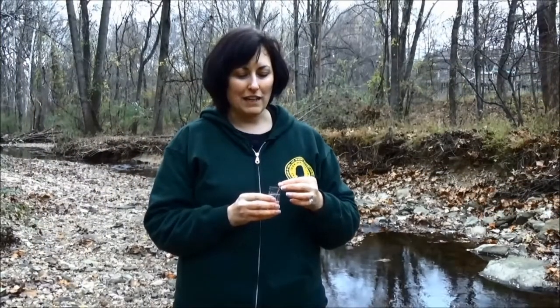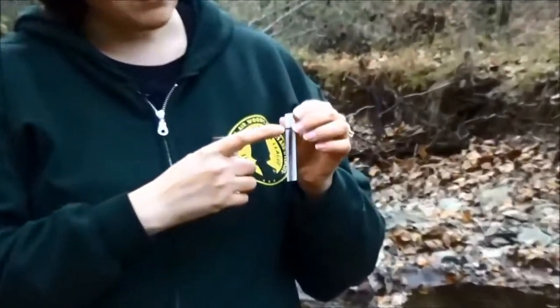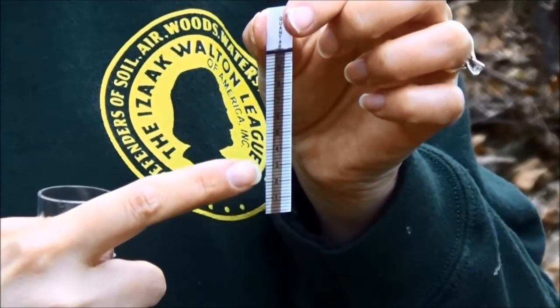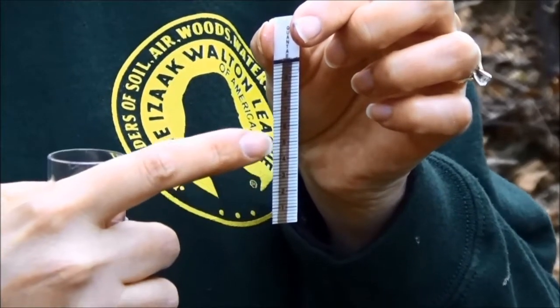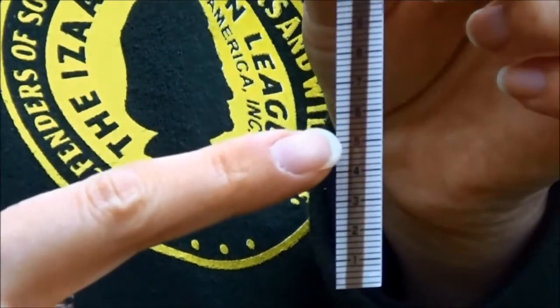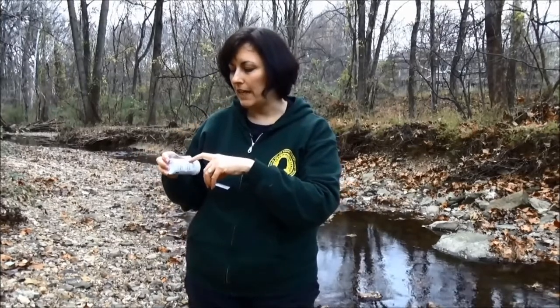So now we're going to take our chloride reading. As you can see, the top stripe is completely black now. What you want to look for is a light-colored mountain coming up on this darker colored strip. We want to look at where the top of that light color is and read the number across. Each of the lines on this strip is 0.2, so what we have here is a reading of 4.8. Then you look on the bottle of your chloride sample and you can convert your 4.8 to 221 parts per million of chloride.